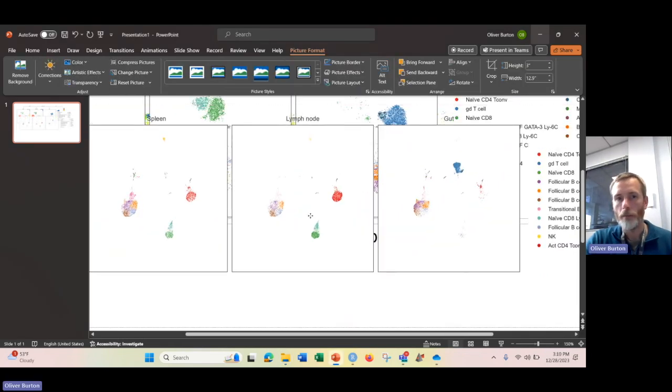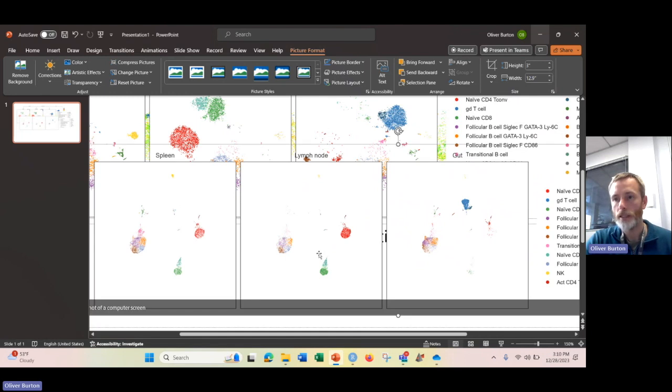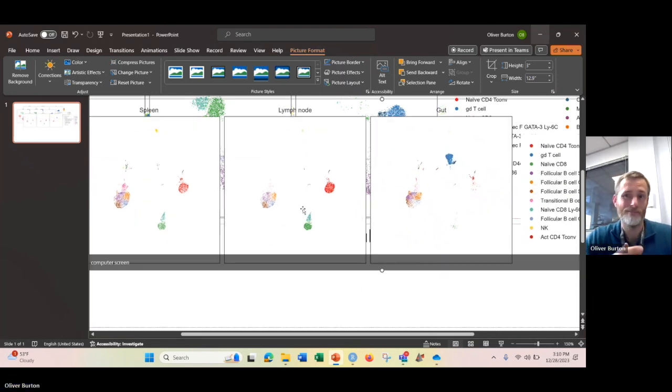So the UMAP tends to be much more compressed than a t-SNE. That's sort of the only difference visually. I mean, there's slight differences in the math that are kind of irrelevant for most of us. So if you like the blobs pushed together more, there's your UMAP.